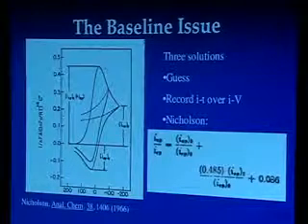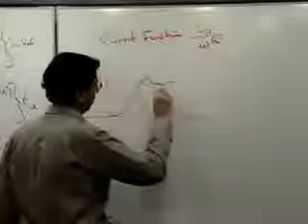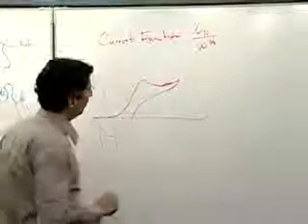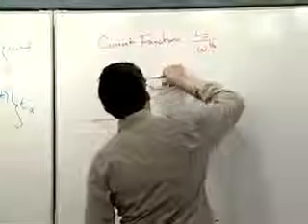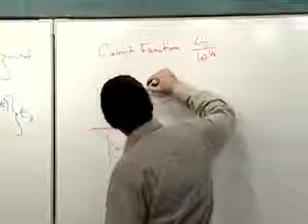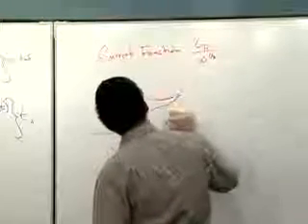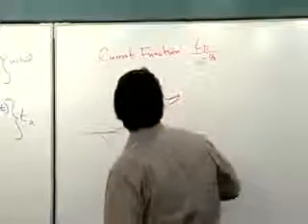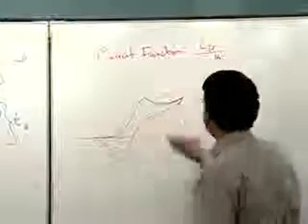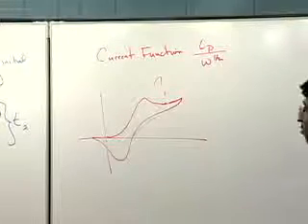That is, what if your cyclic voltammogram looks more like this? Ugh, never like that. That's ignoring my little artwork. That's not too unusual. You're not getting this nice thing down here and whatnot that allows you to do that. So what do you do? Guessing becomes hard then. It's easy if you have a nice cyclic voltammogram to guess, but it becomes difficult if you have this.